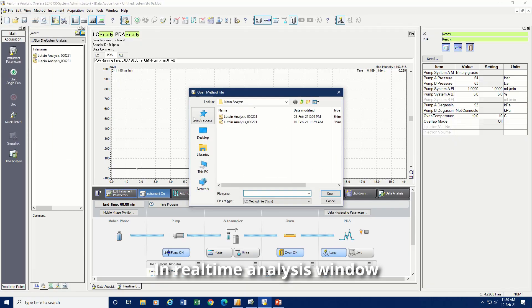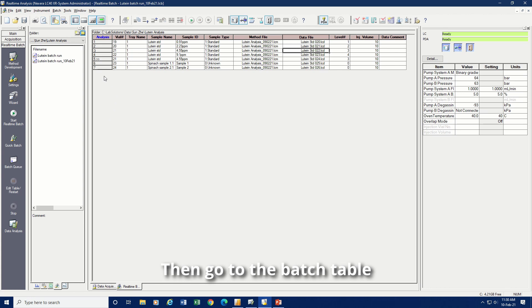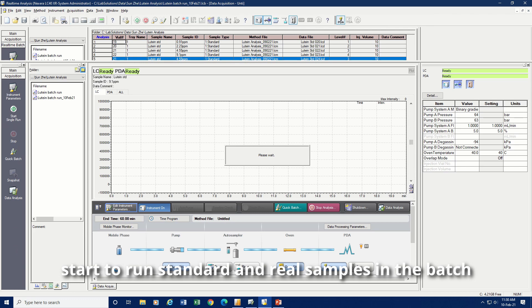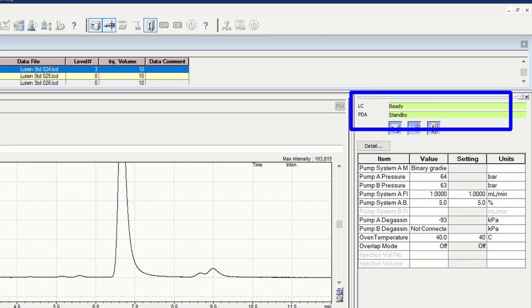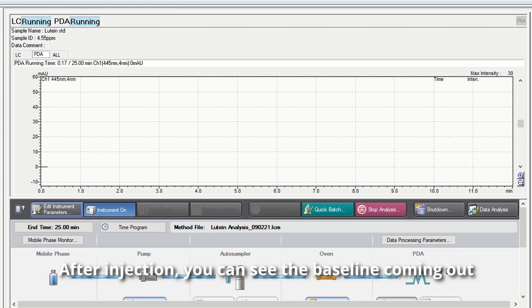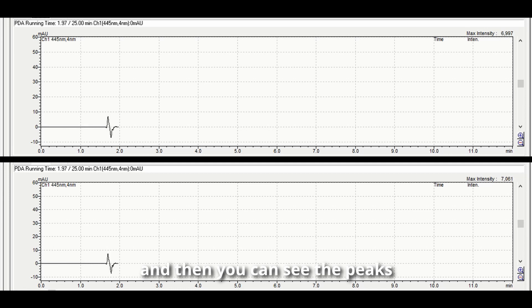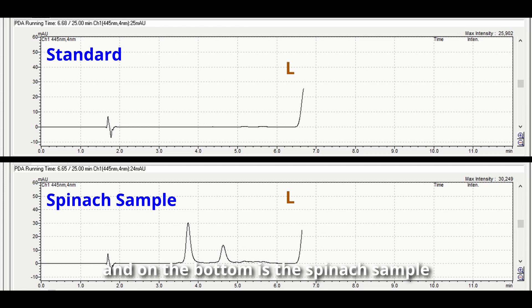In the real-time analysis window, load the method file for the lutein. Then go to the batch table and start to run the standard and real samples in the batch. After injection, you can see the baseline coming out and then you can see the peaks. On the top is the lutein standard and on the bottom is the spinach sample.